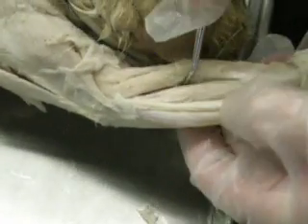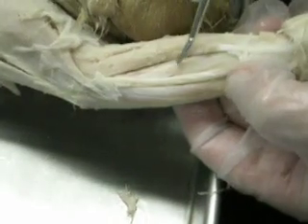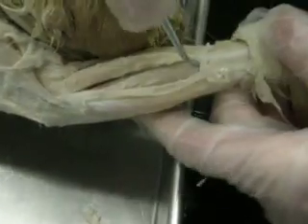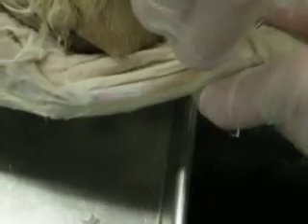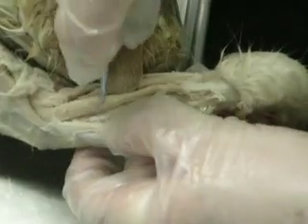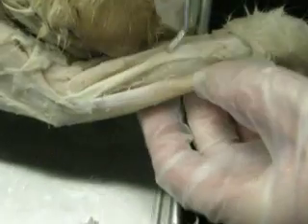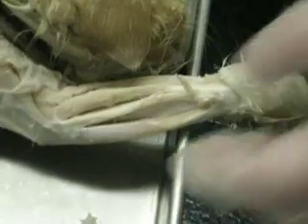This is the supinator, and you can see it's in the upper part of the muscle. There's a big line there. The extensor pollicis brevis is down here. This is the extensor pollicis brevis here. The supinator is on the upper third; the extensor pollicis brevis is on the lower.